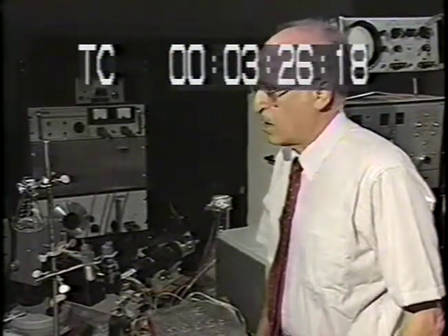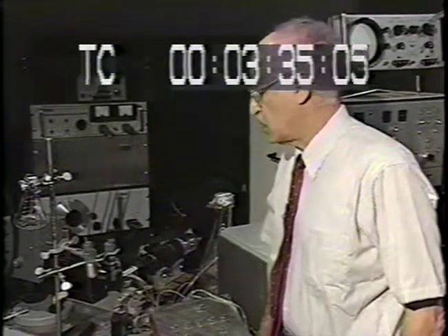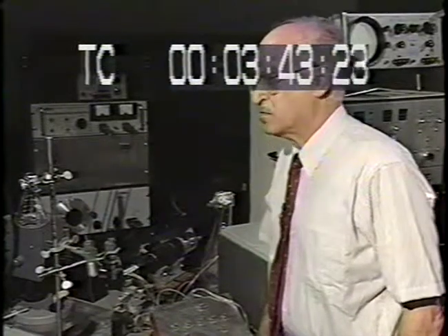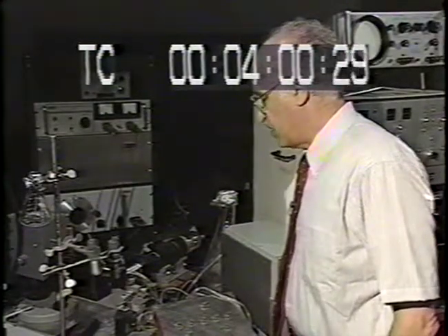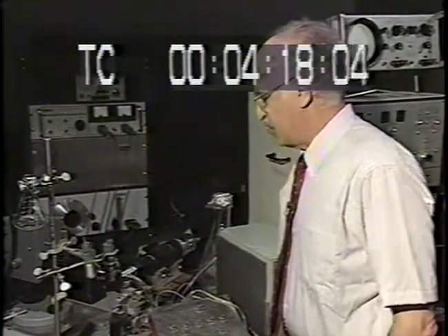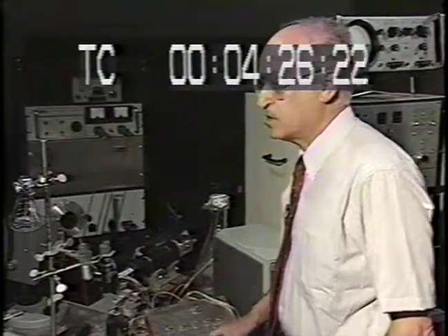I was supplying cells, and so I became aware of the potential uses of the instrument, and I wanted one, and Marvin was nice enough to offer me to build a copy of it at Los Alamos. And he did, and sent it to me, and from the inventory numbers I can see that was in 67 when I received the instrument. And luckily I never tinker with it. I'm not an electronic expert, and I used to call Marvin every other day about little things on how to make the instrument work. So I kept the instrument as it was originally, and as far as I know, it's still in working order.